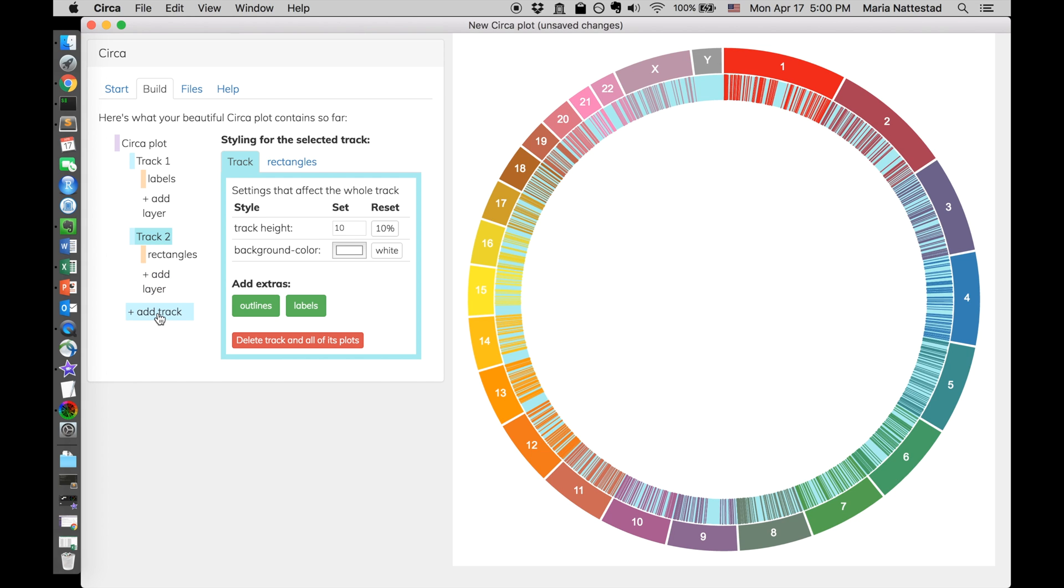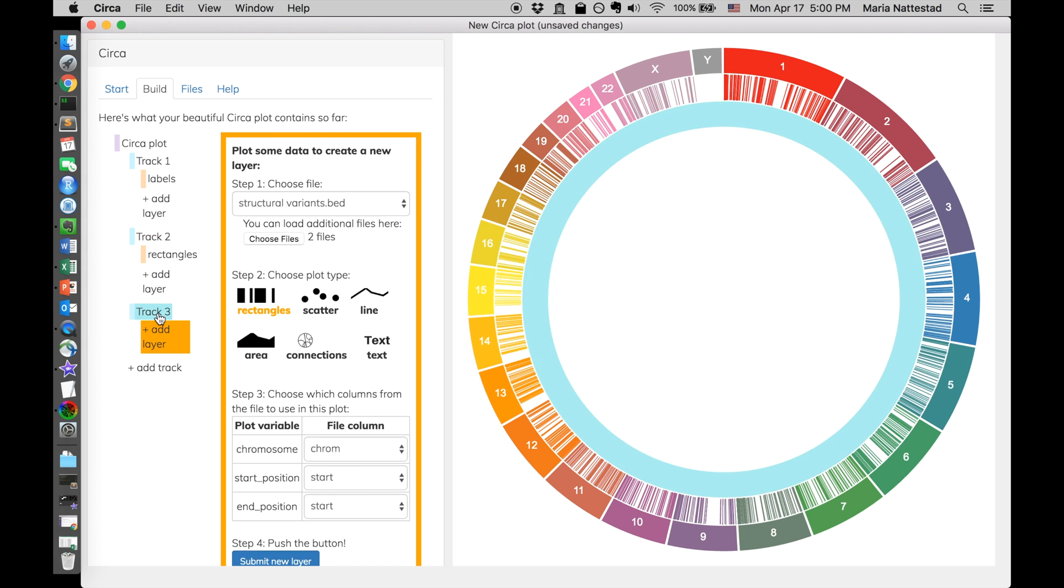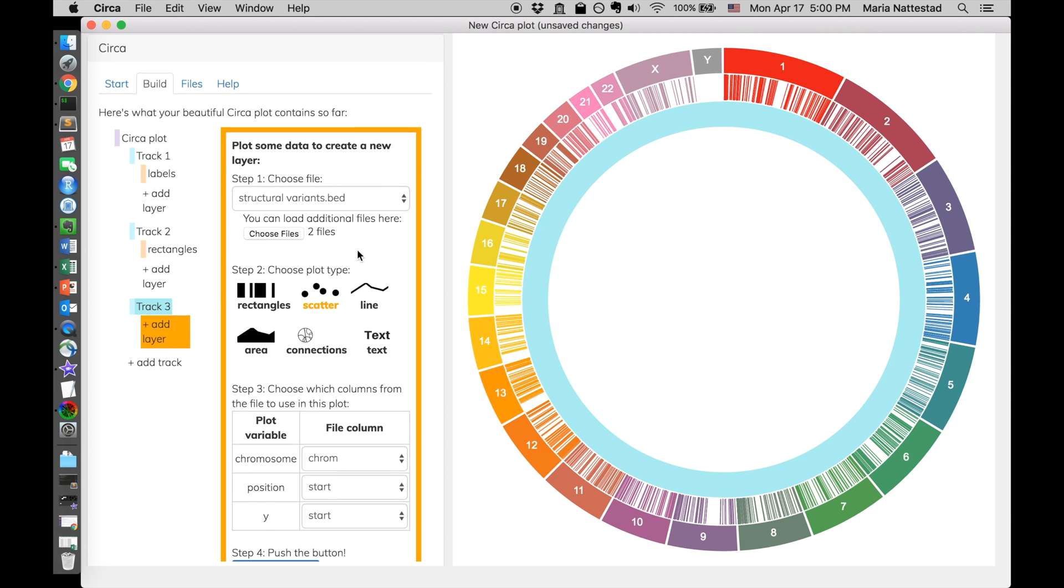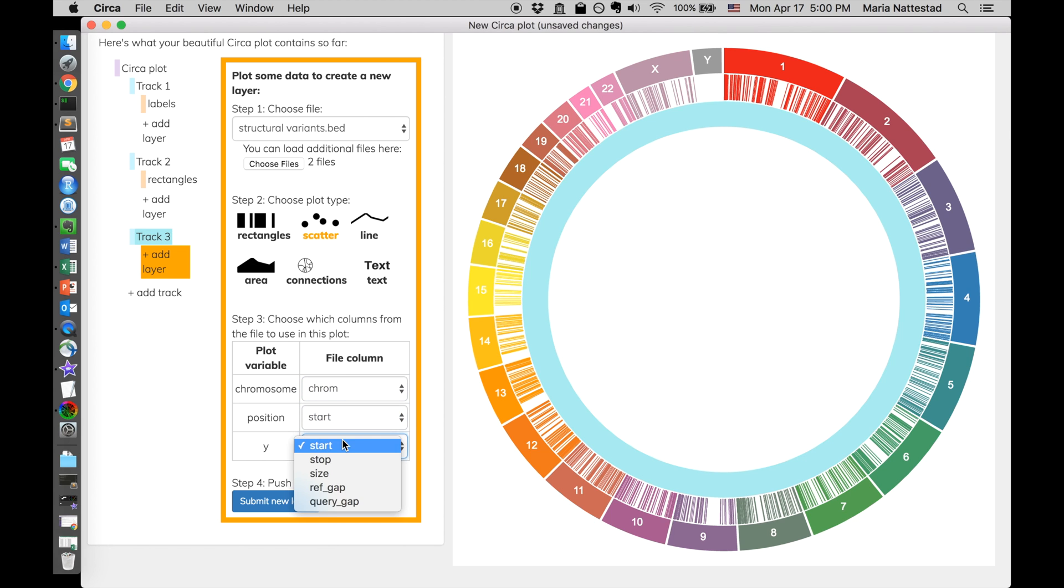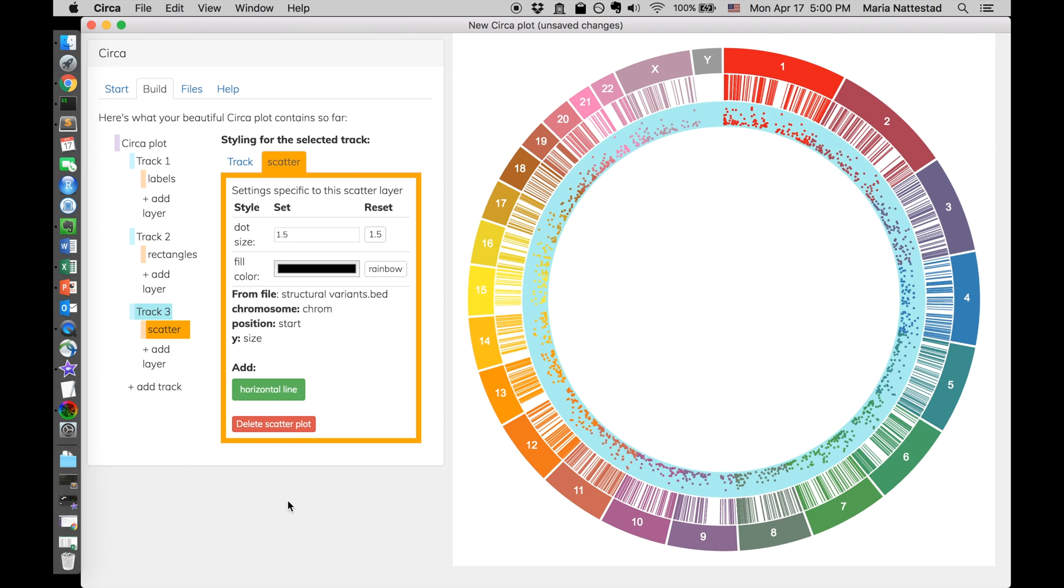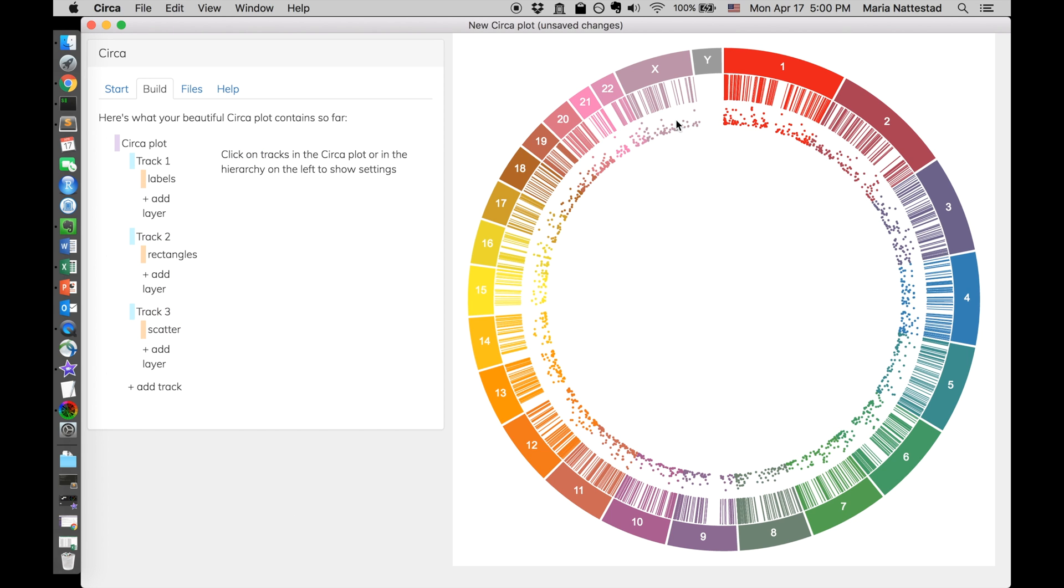That's it. Now let's make another track, and we still have this selected, so I'm just going to pick scatter plot for these structural variants. Chromosome correct position can be start, and the y location here can be the size. So this one has a y instead of a start and stop. All right. So this is good. And so this y position right here determines this would be basically zero, or the minimum on the scale. It scales it automatically. So this is the minimum, and the outside is the maximum.